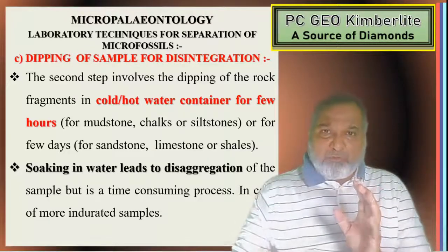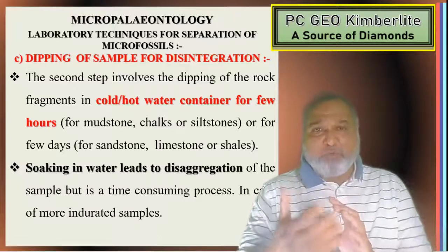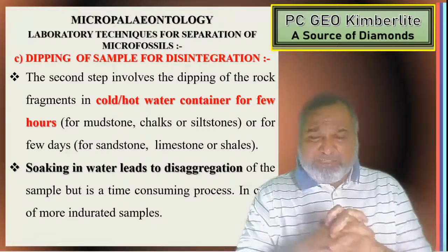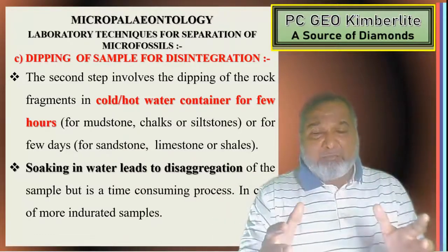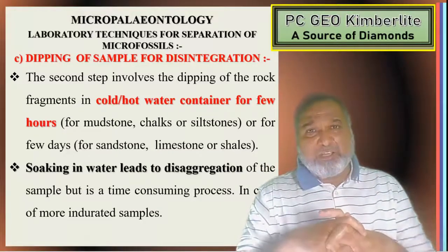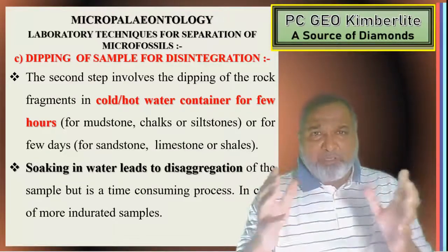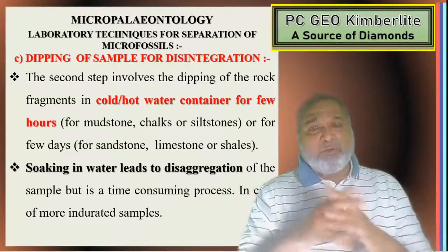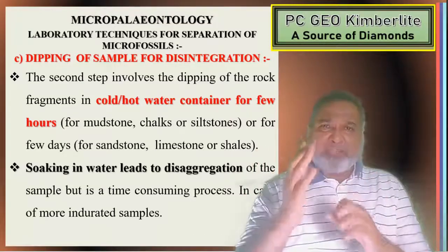Sometimes we have to boil the water, and the process has to be repeated to keep wear and tear to a minimum. This process is tedious and long, but with the utmost care we have to do this separation technique in the laboratory, because getting the sample from the field costs a lot of money and patience. Once you have brought the sample into the laboratory, there is no need to hurry the separation. Step by step we can go through it.